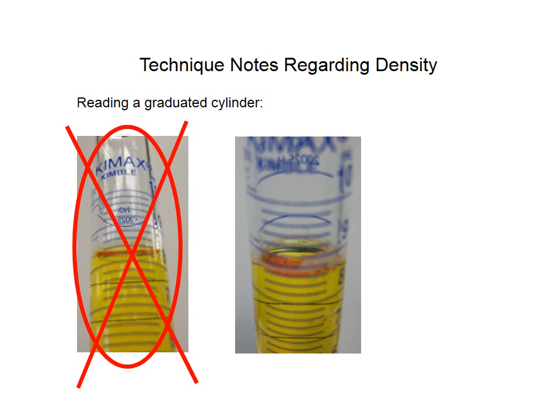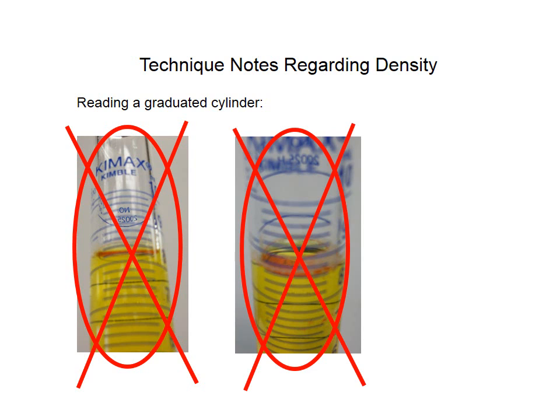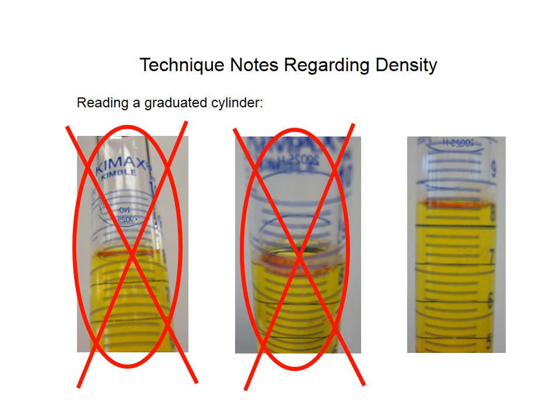When you go to read it, you want it to look like one line, so you can get down much lower in order to read it. And so you don't want that either. What you do want is something that looks like this. Now you have to keep in mind that I'm taking these pictures and I'm not that good at it, and I have bad eyes anyhow, so it's kind of an interesting thing.